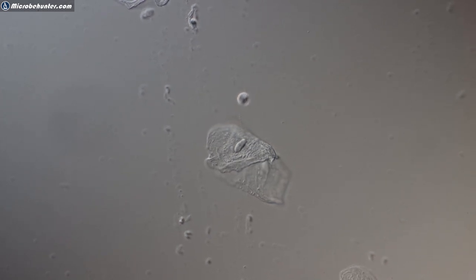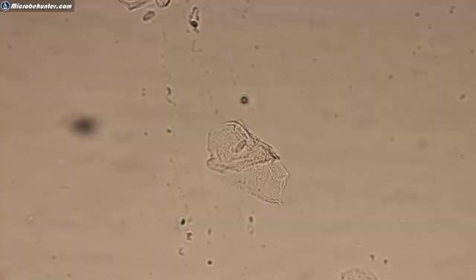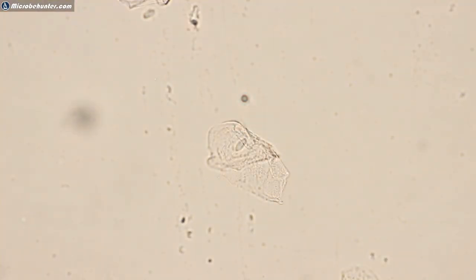You might see a little difference. So I'm not focusing, okay? I'm just adjusting the objective now. Yeah, so this is basically, now so you have seen, let's look at this also at this magnification using bright field. Just a second. Yeah, okay, that is the bright field image, okay? So this is basically what you're gonna see with a bright field microscope, and you're still able to see this, okay?